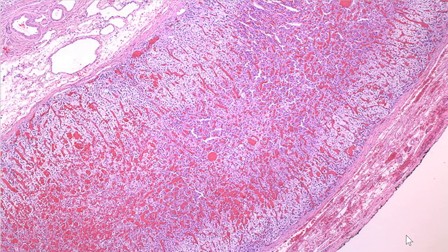So first thing we're going to do is find the apical surface here, right? So we can see that this is our capsule right here.